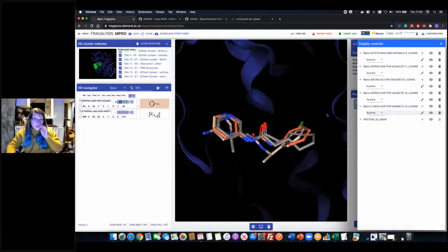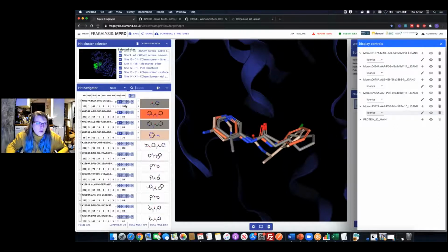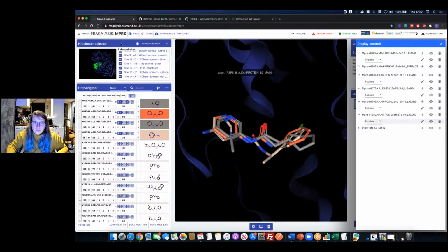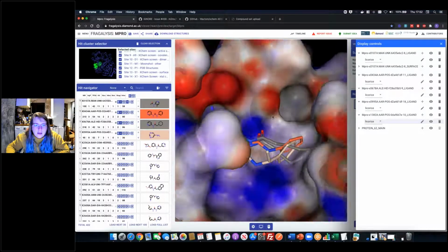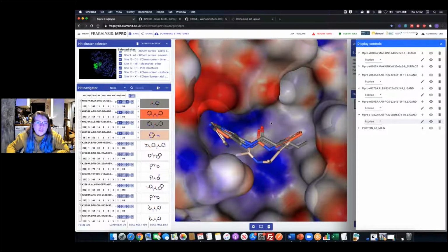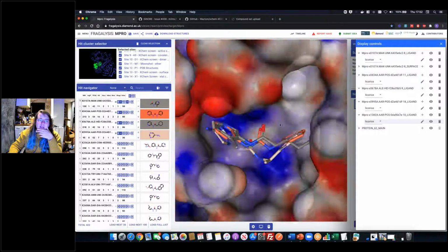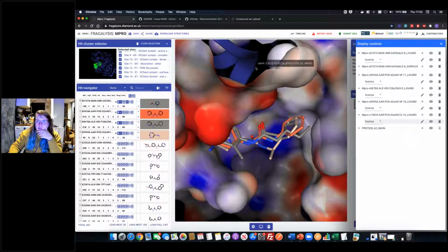And then you can sort of see, I'll turn on a surface as well. Why not? So these are all crystallized in the active site, and they're crystallized in parts of the active site known as P1 and P2. So that's pocket 1 and pocket 2 out of the 4 different pockets where the native ligand sits. And you can see quite clearly from these ligands opportunities for elaboration, I think. We just turn that surface off again quickly.